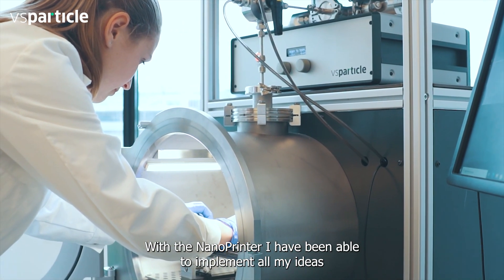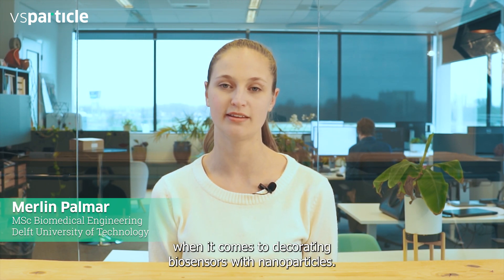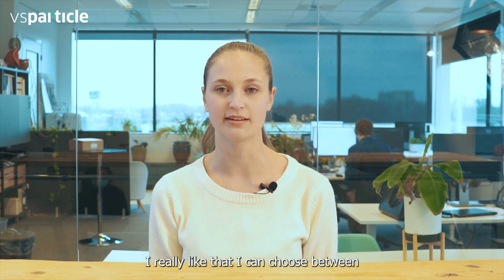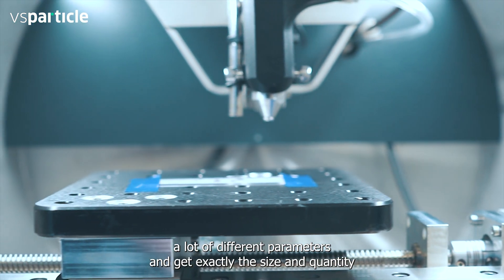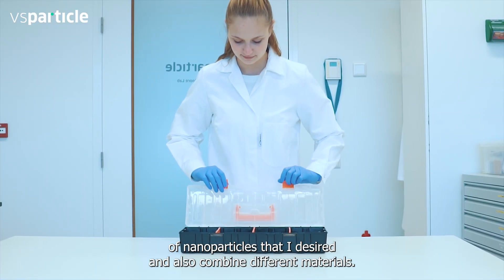With the nanoprinter I have been able to implement all my ideas when it comes to decorating biosensors with nanoparticles. I really like that I can choose between a lot of different parameters and get exactly the size and quantity of nanoparticles that I desire and also combine different materials.